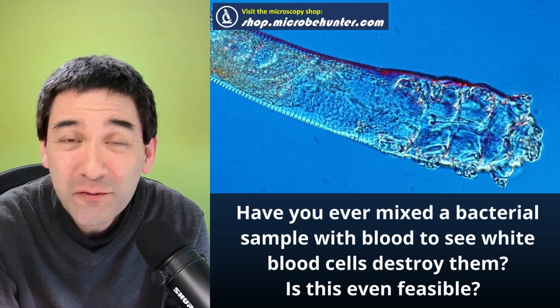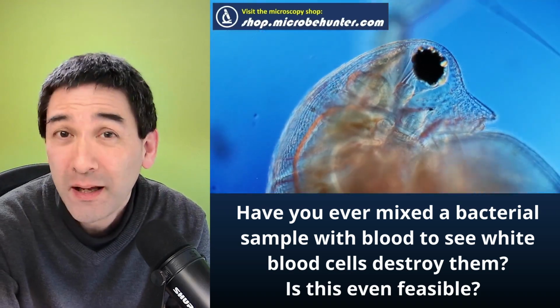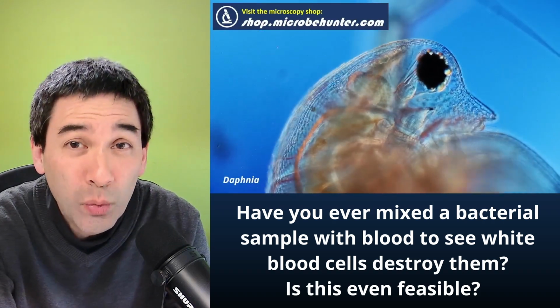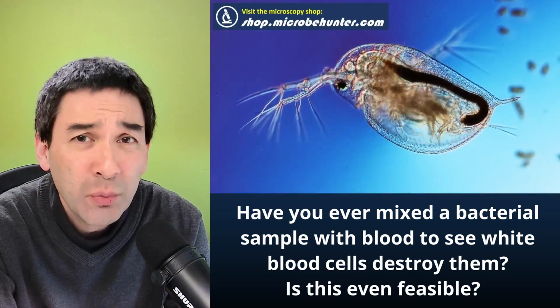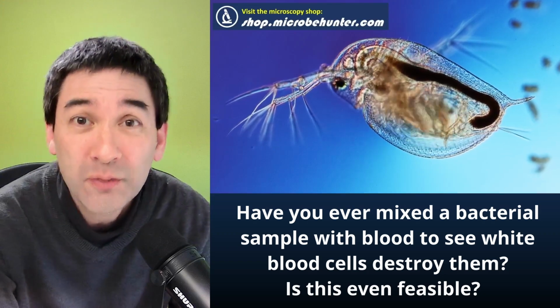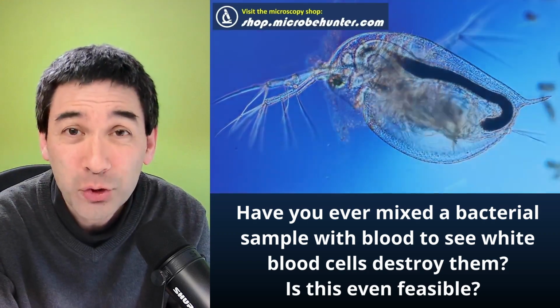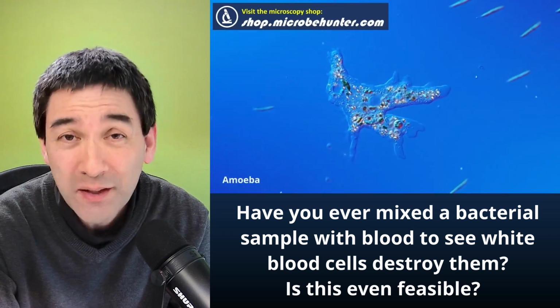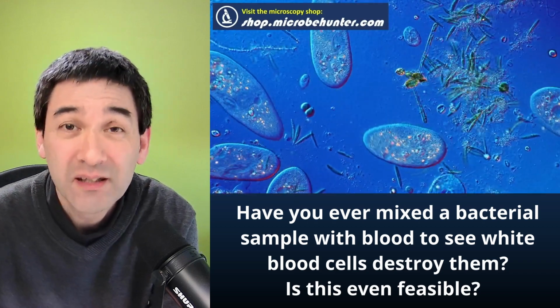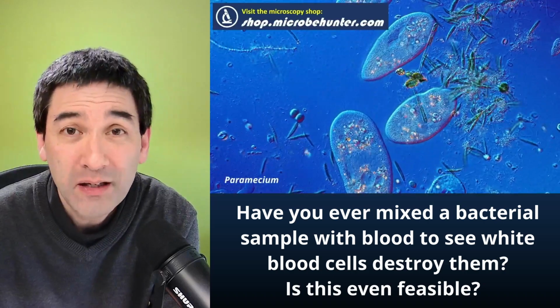Of course, there are also safe sources of bacteria, for example, yogurt bacteria and so on are of course available, and I would probably try it with those first. Now, some time ago I saw somewhere on YouTube a video, or was it a YouTube short, where someone put a nematode worm together with some blood, and it was then possible to actually see the white blood cells attacking the nematode worm. So this therefore should be possible. And the reason why this actually works is because the bacteria are releasing certain chemicals, and the white blood cells, the phagocytes, are following the gradient of these chemicals and are therefore able to detect where they can be found.